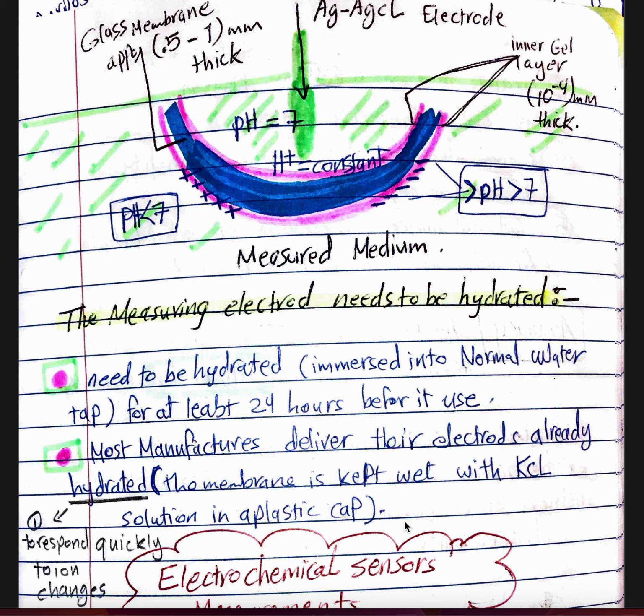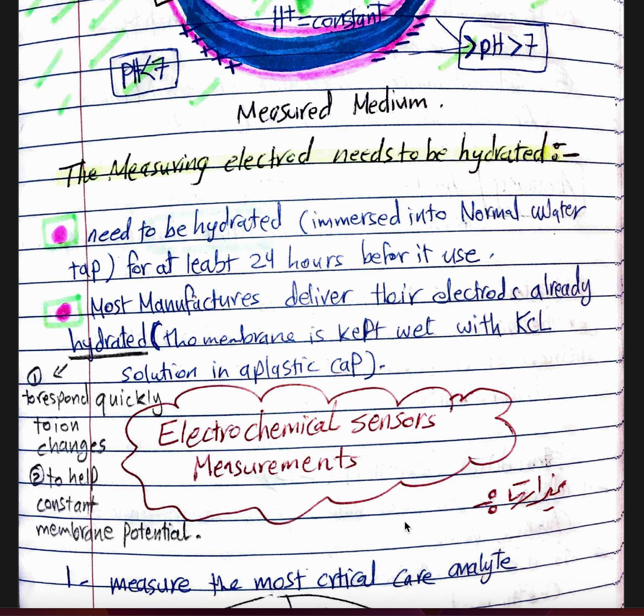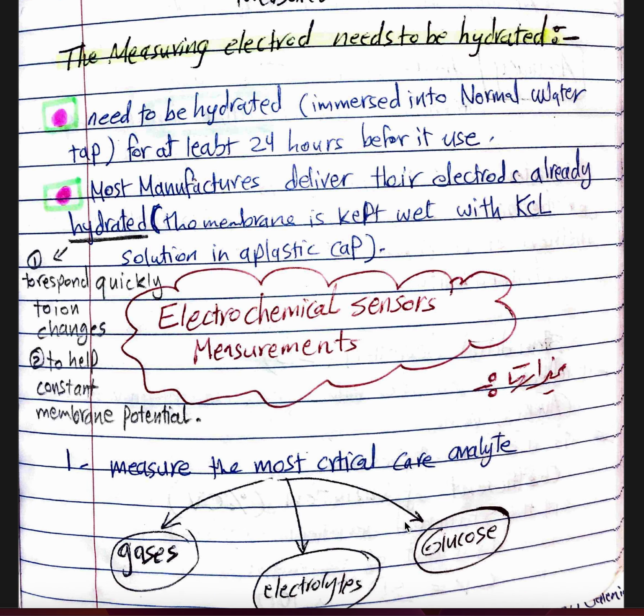a plastic cap. So if it's not hydrated with the KCl, then we have to hydrate it for 24 hours before it is used. But if it's already hydrated with the KCl and kept in a plastic cap, we make sure that it's hydrated, then it's okay, and we have to do nothing.